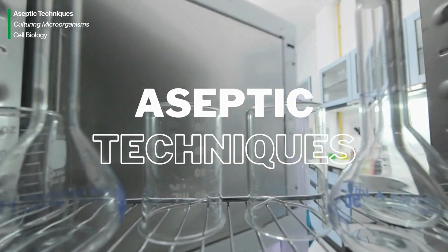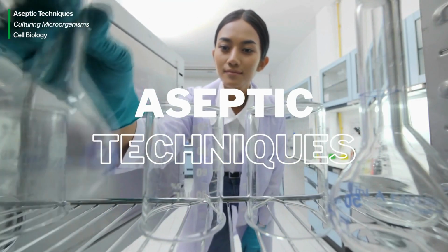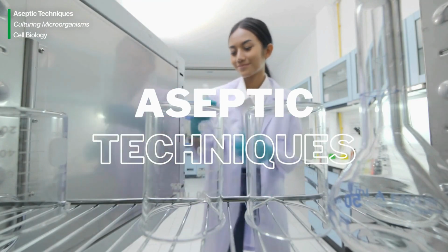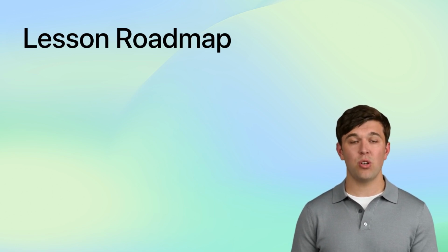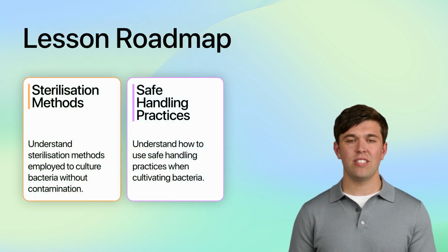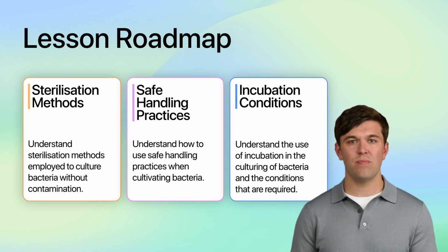Welcome to today's lesson on culturing microorganisms, specifically focusing on the vital process of preparing an uncontaminated sample using aseptic techniques. This is an essential skill in cell biology and pivotal for ensuring accurate and reliable results when studying bacteria. In our lesson today, we will explore the key aseptic techniques employed to culture bacteria without contamination, including sterilisation methods, safe handling practices, and the use of specific tools and media. These techniques are crucial for preparing uncontaminated bacterial cultures, which are necessary for precise scientific experiments.